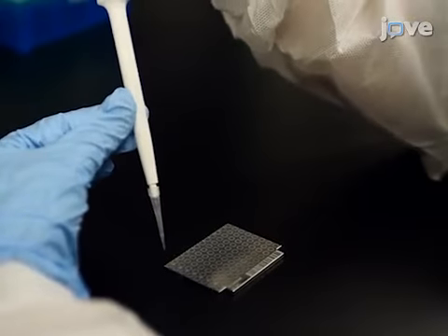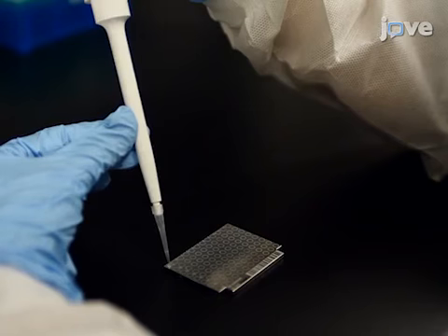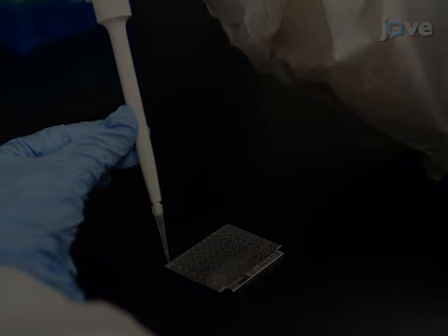Begin this procedure with deposition of 1 microliter of protein extract containing no viable cells onto a stainless steel MALDI target.